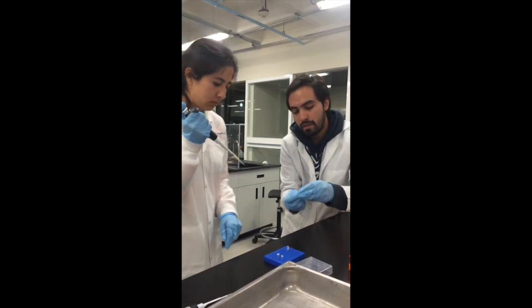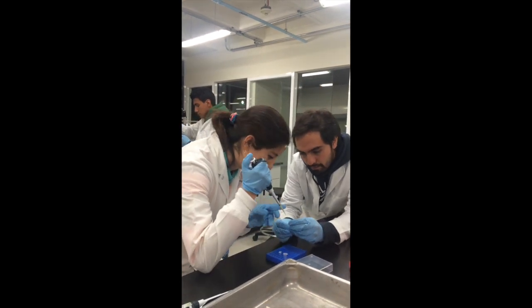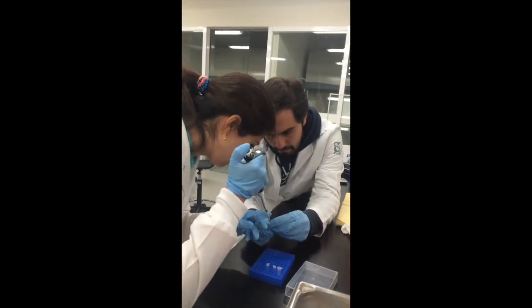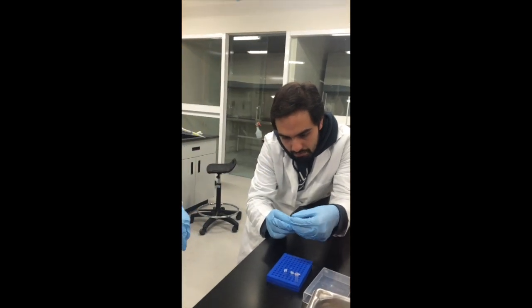As for lane 4, as expected, the PCR product is observed, with little degradation and a possible cell contamination. At the very bottom of the agarose gel, in lanes 2 to 4, two marks can be observed, which we attribute to the existence of unused dNTPs and primers during the PCR reaction.